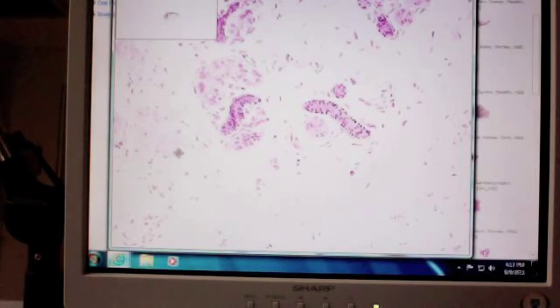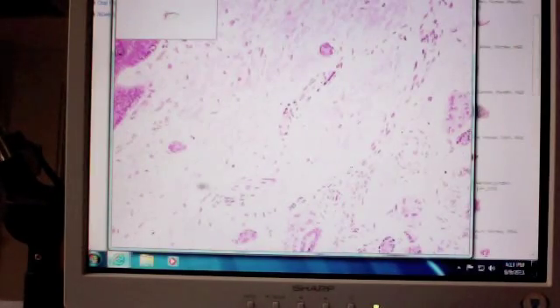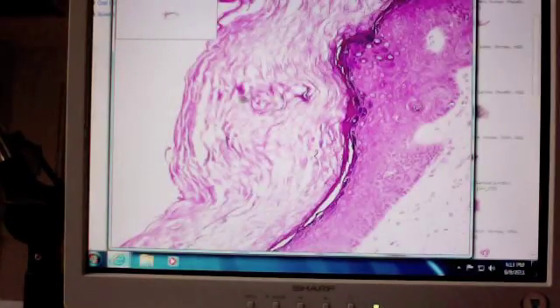The bottom end of that tube is going to be the secretory portion. Then the top end of it is going to be the ductal portion, and the ductal portion in this case will wend its way all the way up through the connective tissue here. You can see here's a duct, here's part of the duct, here's part of it, going all the way up eventually to the surface. In fact, you can probably see it going through these keratinized cells here. There's part of the duct inside the epithelium. So the duct itself is also coiled all the way up to the surface.